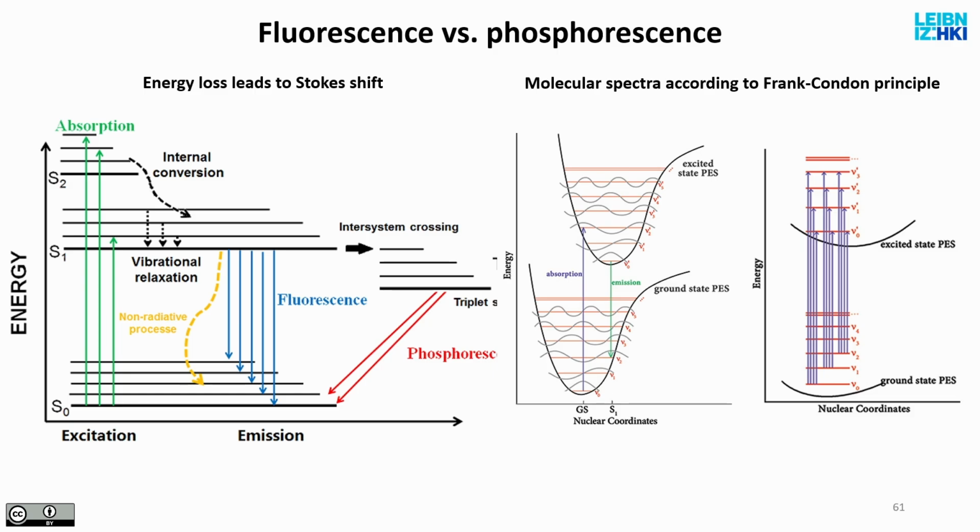Certain detail, just to make this a bit more realistic. When a molecule is in excited state, these excited states are not just one very, very precise energy level, but rather a range of levels. And the molecule will try to relax itself by transitioning between these sub-energy levels, which means that the energy that is eventually released in form of this fluorescence photon is a little bit less than the energy that came in.